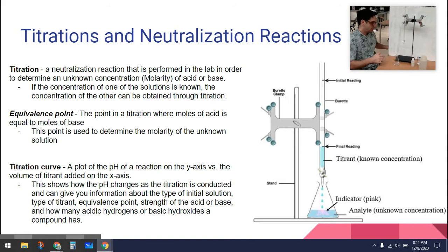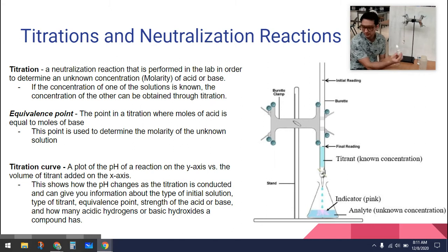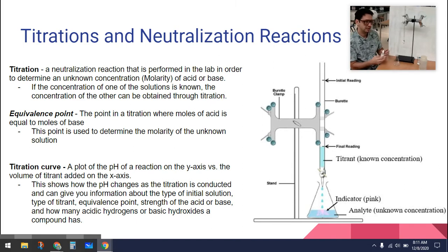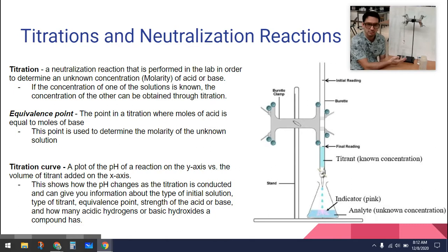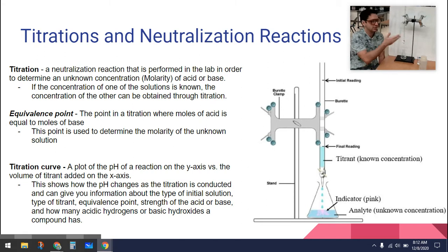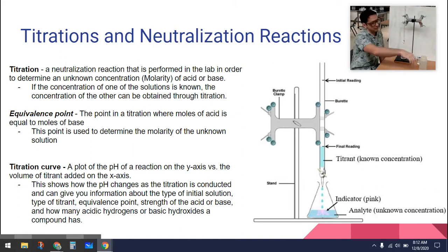Then we add something called an indicator solution. This indicator is called phenolphthalein. Phenolphthalein is clear in acidic solution and turns purple in basic solution. So when I add it to the acid, nothing happens — it stays clear. But as I add base to this, eventually the solution will turn basic and change color. When it changes color, I know I've added enough base to equal the amount of acid, and now I have an equal amount of base and acid in solution.